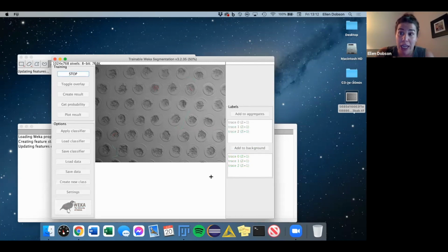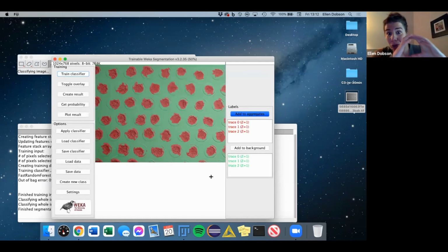So you can also change the region of interest. The default is to just draw the squiggly line because that's the minimal number of pixels. If you, for example, want to use a circle or whatever, just know that all of those pixels inside will be used during the computation. So it'll eat up a lot more memory. So that's a trade-off again. So again, you want kind of the minimal pixels.